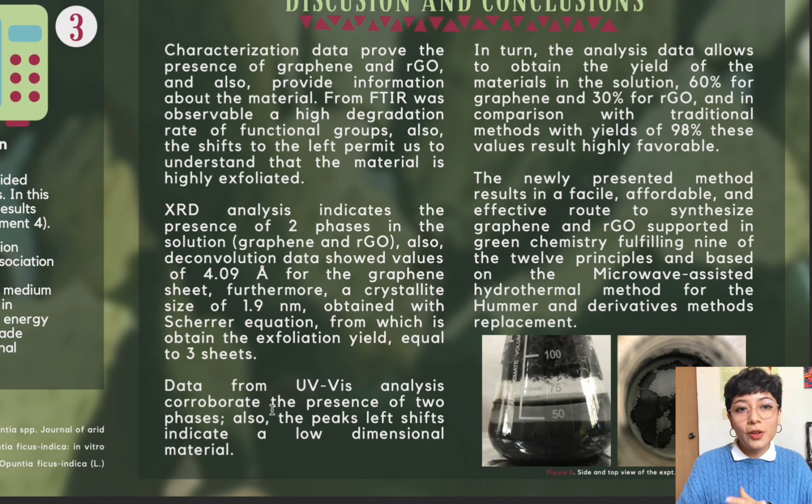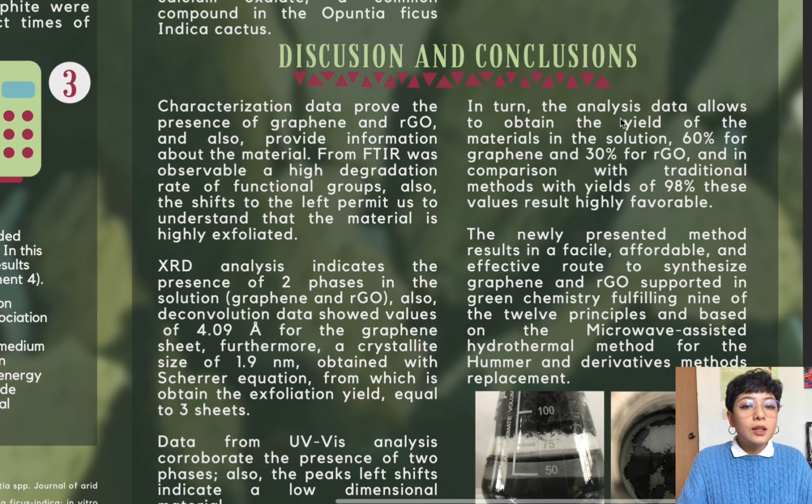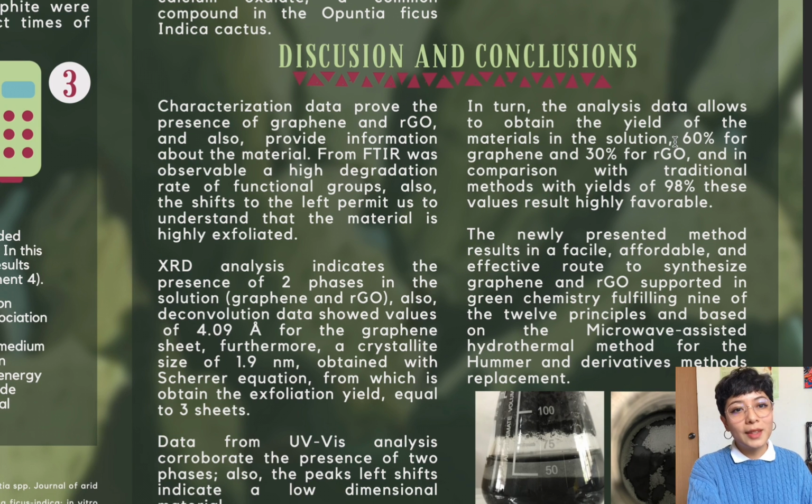Data from ultraviolet-visible analysis corroborate the presence of two phases. Also, the peaks' left shifts indicate a low-dimensional material. In turn, the analysis data allows us to obtain the yield of the materials in the solution, 60% for graphene and 30% for RGO. And in comparison with traditional methods with yields of 98%, these values for a completely green synthesis route are highly favorable.